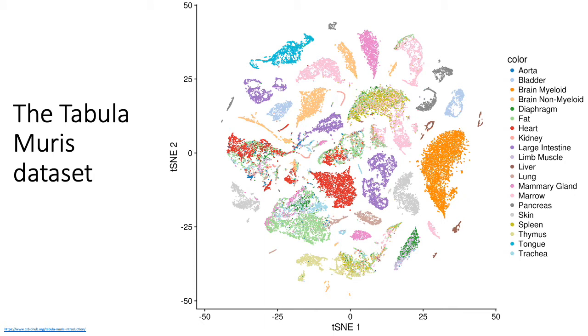And so here's a classic, what's called a t-SNE visualization of a single-cell RNA-seq dataset. And so in your typical visualization, you are visualizing a large dataset of single-cell RNA-seq, where the x and the y-axis are just kind of a 2D representation of your cells, and each point represents a single cell in your dataset. And in this particular case, a method called t-SNE is used to visualize your data. Other common software includes things like UMAP.